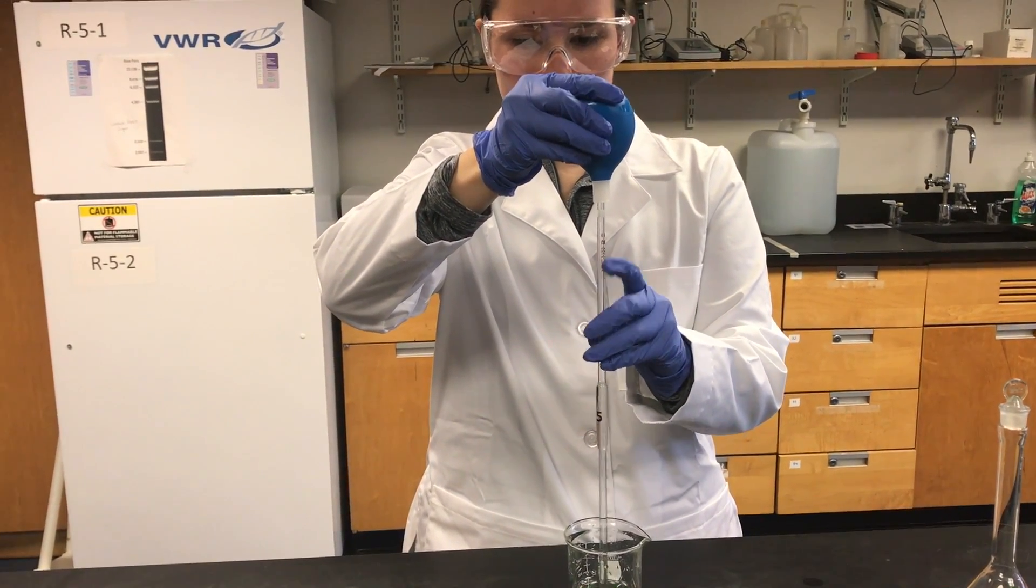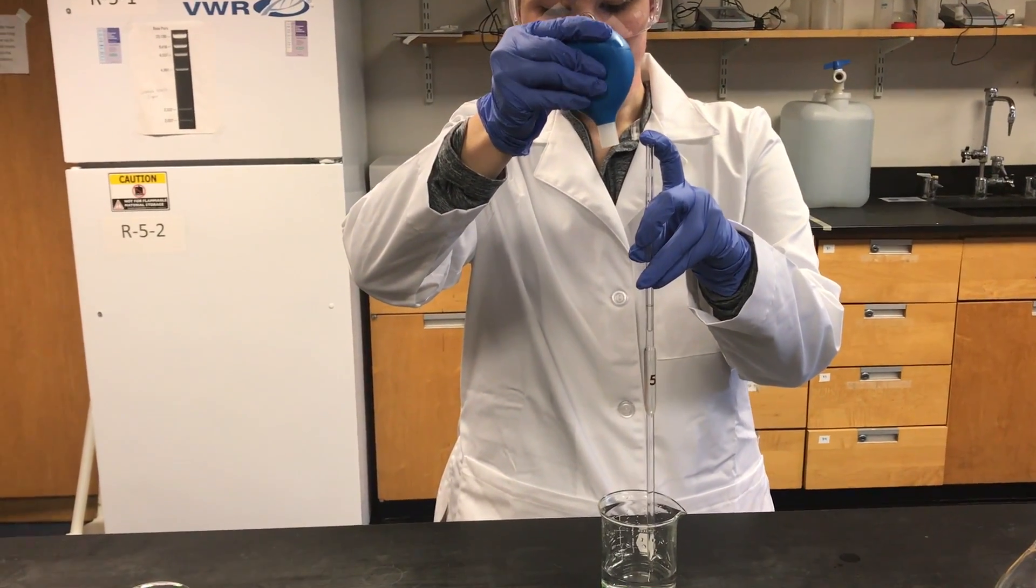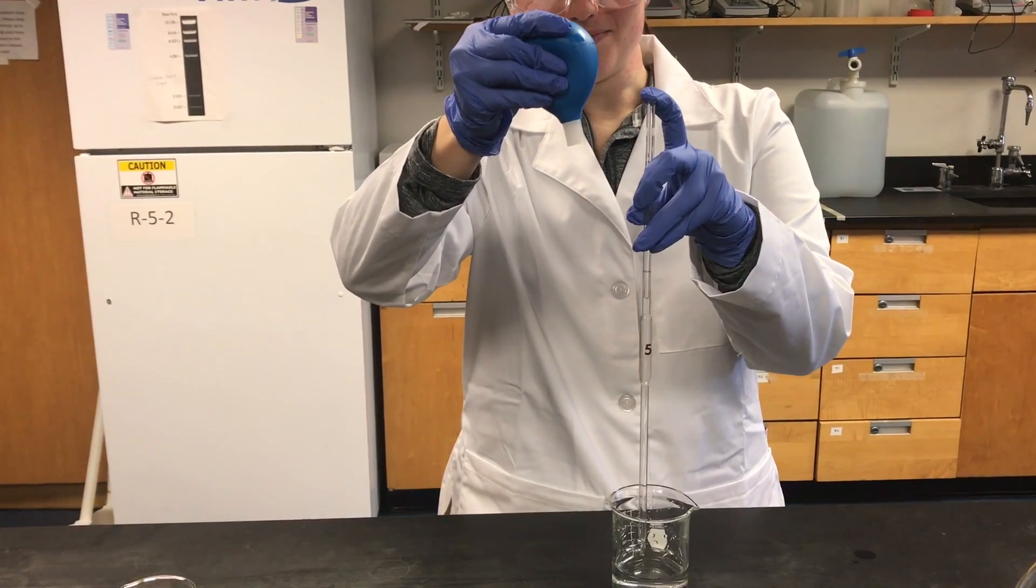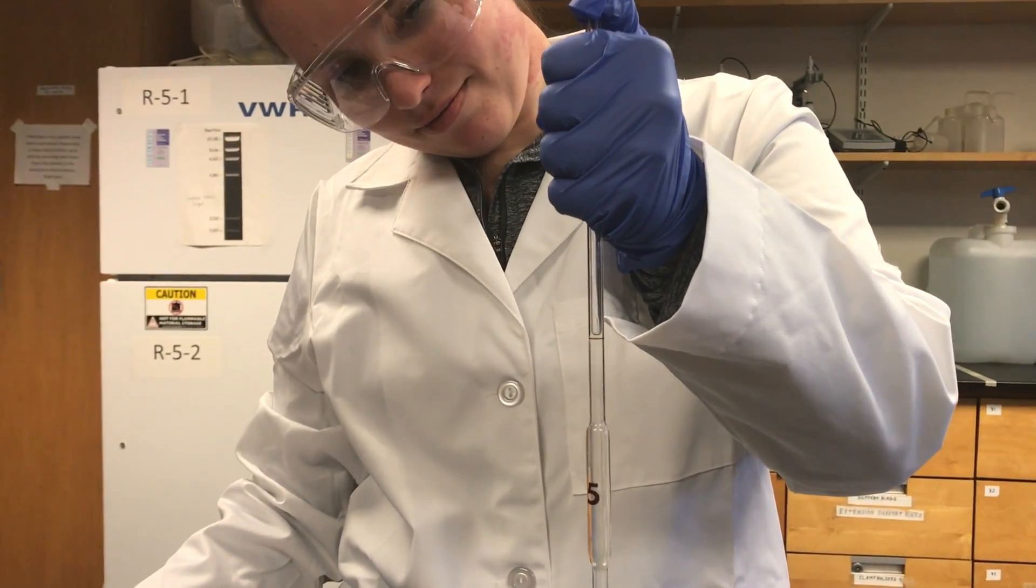The liquid will begin to rise. Once it is above the line, remove the bulb and cap it with your finger. Slowly release pressure from your thumb so that the liquid releases until the bottom of the meniscus is at the red line.